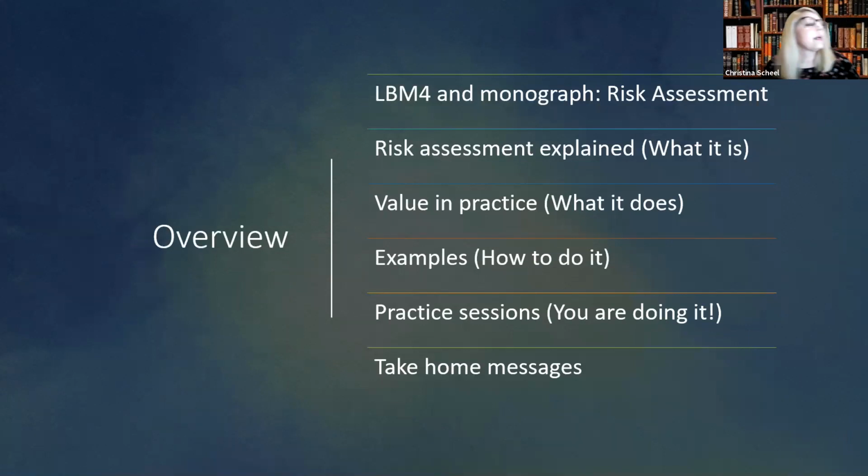I will be talking a bit about the topic of risk assessment in the LBM4 and monograph, and I'll be explaining what risk assessment is, also the value in practice, or the importance of it, or what it does. Then we'll go through some examples and how to do it, and then we actually have a practice session. So we'll all be working together as best we can on a risk assessment. And then finally, I'll have a few take-home messages for you.